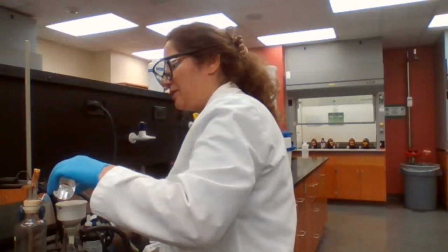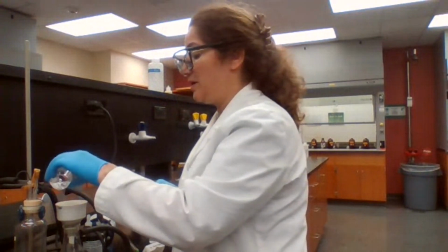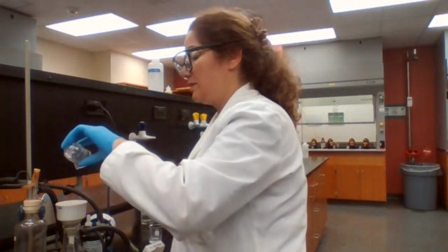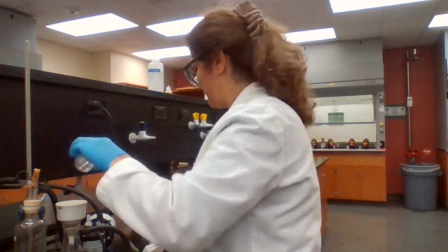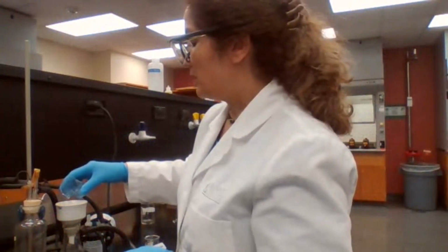Going to wash the sample with sodium bicarbonate. Next step, washing the sample with sodium bicarbonate. Continue by washing with cold water.